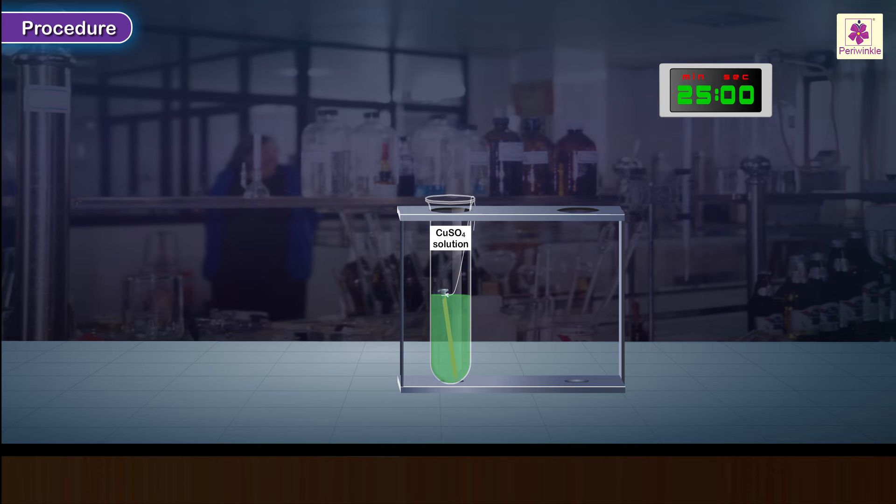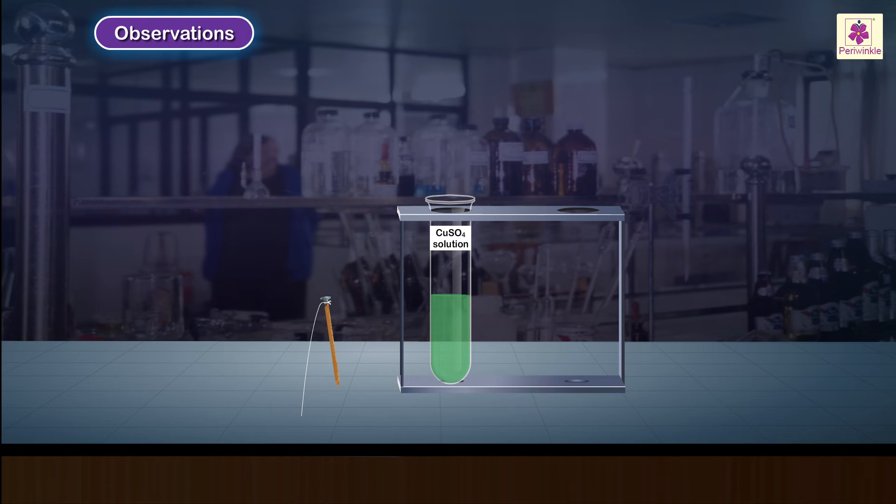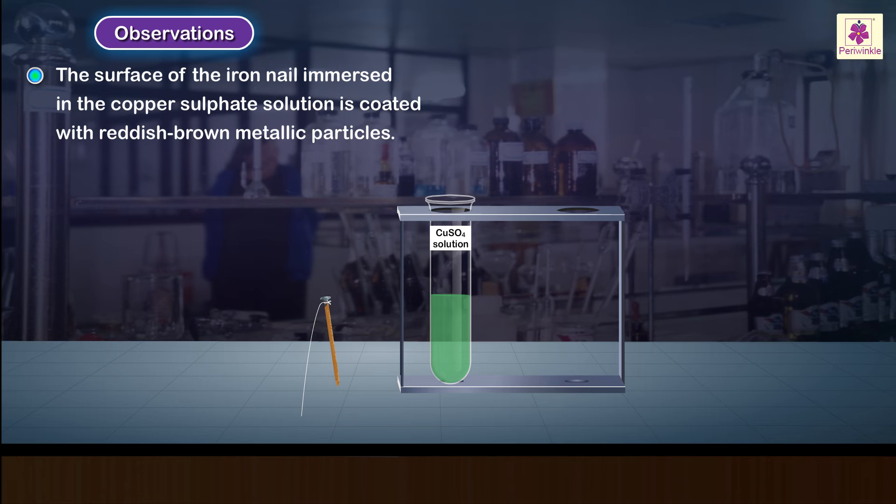Carefully pull out the iron nail immersed in the copper sulphate solution and observe its surface. Observe the colour of the solution and the iron nail. Observation: the surface of the iron nail immersed in the copper sulphate solution is coated with reddish brown metallic particles.